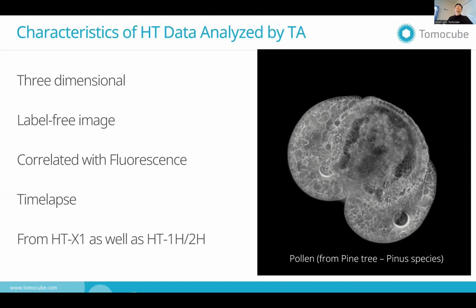So in general, most of the analysis software in biology imaging nowadays is based on two-dimensional, but it's expanding to three-dimensional. The approach is very different from two-dimensional, so we should take into account the difference. And at the same time, holotomography data is a label-free image, so we should take into account the nature as well. In fluorescence images, which are very typical in biological imaging, it's rather easier to analyze those results. But in our case, it's label-free, so we should take that fact into account.